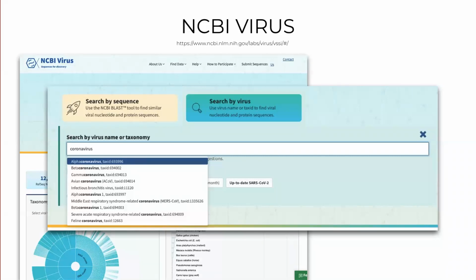So as you get here, one question you might be asking is which virus tax ID should we pick? And the answer to that is you would like to pick severe acute respiratory syndrome related coronavirus, which has a tax ID of 694009. So it's going to be the penultimate one right here at the bottom.